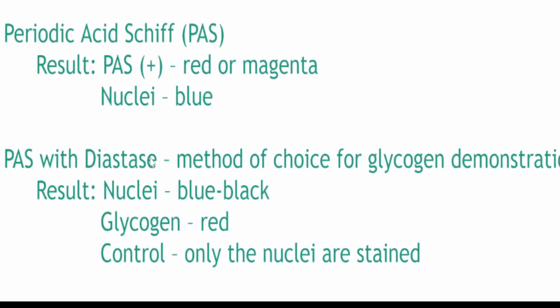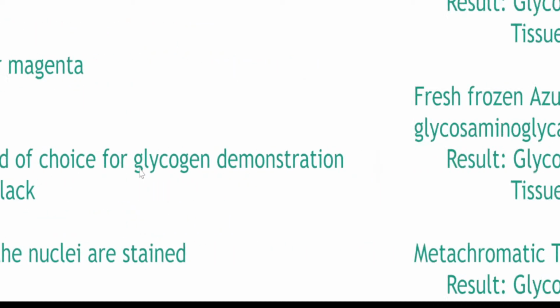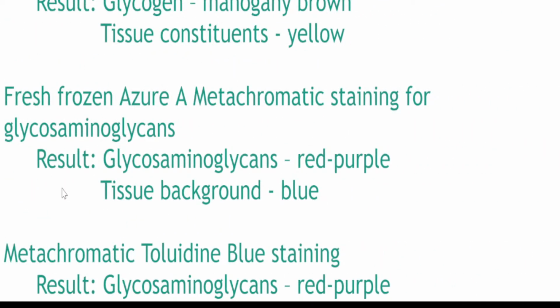Okay, these are again more discussions about stains. I want you guys to pay close attention to which ones are positive, and what results you're going to look at when you're talking about stains. So stains for carbohydrates: PAS with diastase, carmine. These are things that are important. Langhans is obsolete. The reason is that it's not permanent, as well as it's very old, and nobody mass produces the stain because of the many disadvantages.